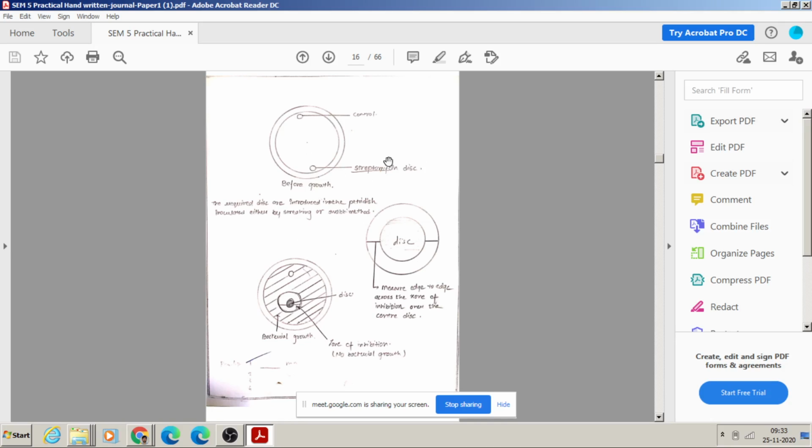Now just have a look at another compound. If you are interested in a plant material, for example turmeric, or ginger, or clove, whatever it may be, a solution of known concentration is prepared from it. The disc is dipped in that solution and brought in contact with the microorganism inoculated on this plate. Of course, the control is without any antibacterial or antimicrobial compound. In this way these two discs are placed.